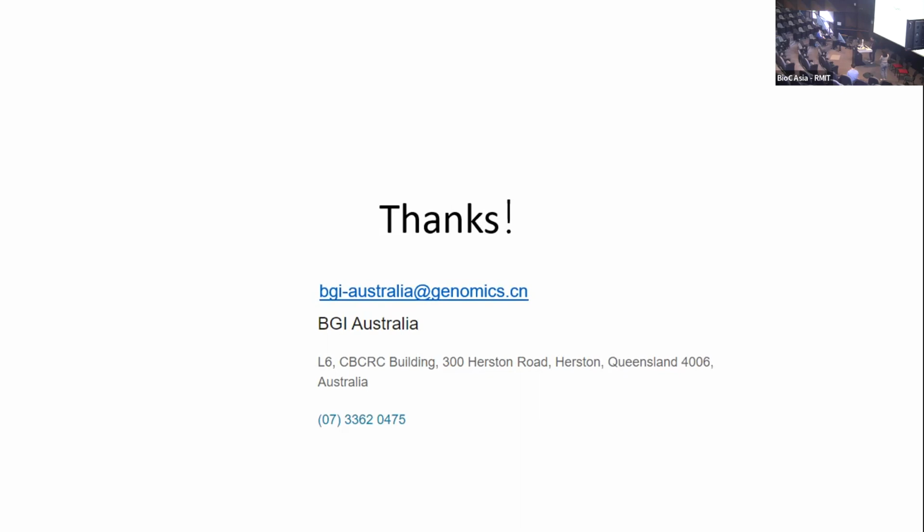Yeah. Actually, for single cell, I think most of them are in R, and we haven't done too much Python work on single cell. We developed this one because we need very big computing power and memory to do the analysis. So we developed the Python one, but I think there should be some. Okay, thank you.